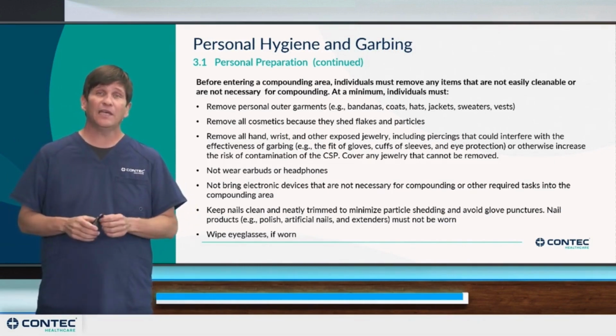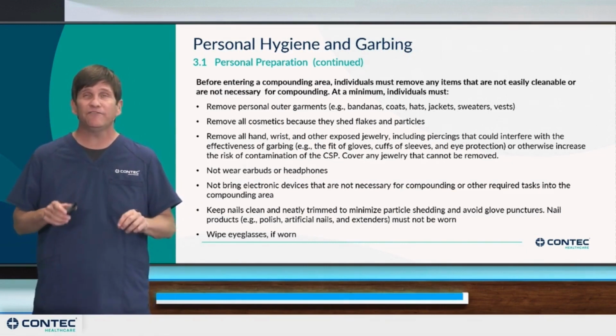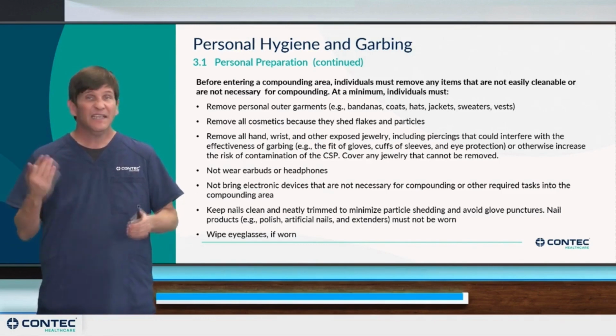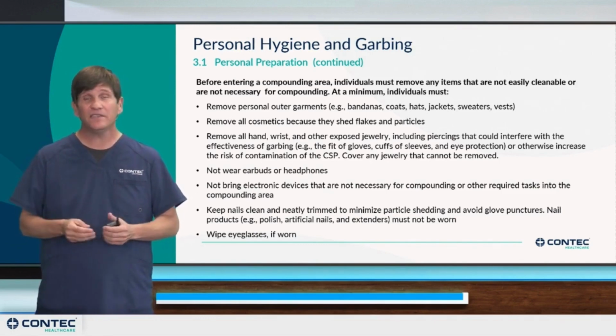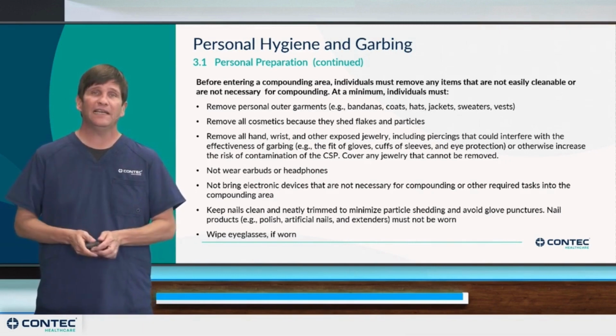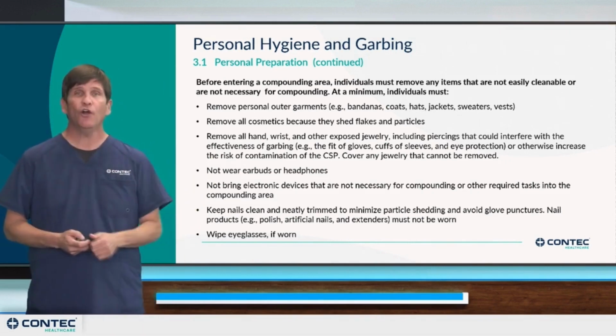disinfect those eyeglasses. As a best practice, Contec recommends you only use disinfectant on the frames. Sometimes disinfectants or sterile alcohol could mess up the coatings on the lenses. So just use a lens cleaning wipe to clean the eyeglass lens itself, but you want to use a true disinfectant to disinfect the frames before you go and begin your garbing process.